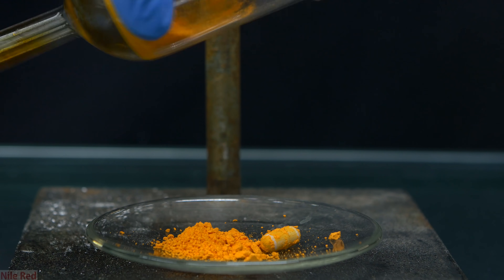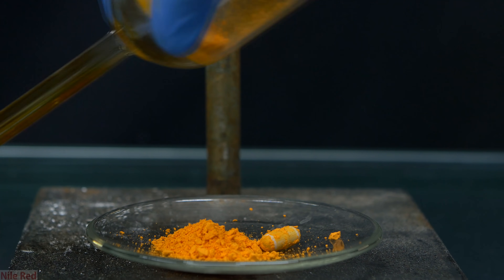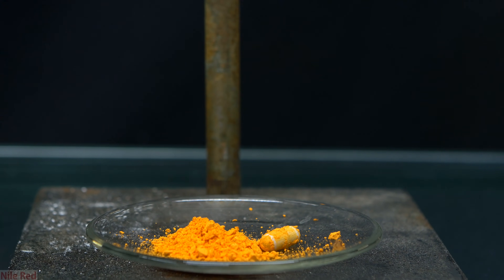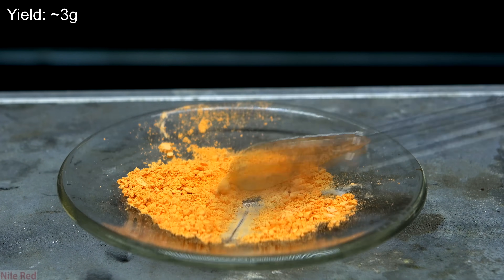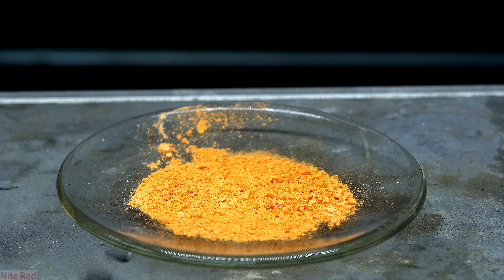I poured the eosin powder out onto a crystallizing dish, removed the stir bar, and dried it in an oven at around 110°C for 30 minutes to get rid of any remaining ethanol. In the end, I was left with about 3 grams of orangey-yellow eosin-Y powder. The yield is actually much less than expected, and I blame this on the fact that the fluorescein I used wasn't exactly pure, with a lot of starting material left over. Still, 3 grams is more than enough to mess around with, so I'm happy with the results.